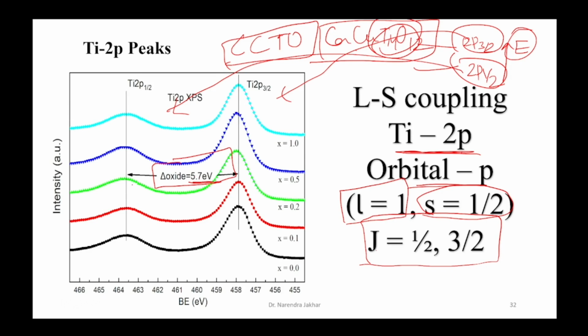So I again want to confirm whether these two peaks truly correspond to the titanium 2p peaks or not. I got the difference, and yes, the difference is the same as reported in the literature.